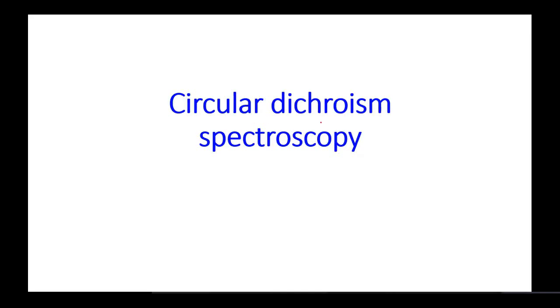Good evening, everyone. Today we will start with the new topic, circular dichroism spectroscopy. This spectroscopy is a kind of absorption spectroscopy.